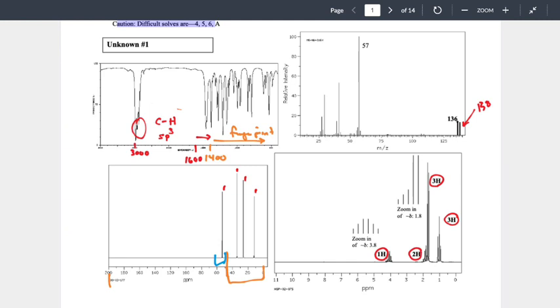Okay? It could be given to you, or it could be the situation where you've got something where it's not given to you at all. If it's not given to you, how do we know we have 4 signals? You started us off with 4. Did you say 4 because of the integration, or do you see something else?